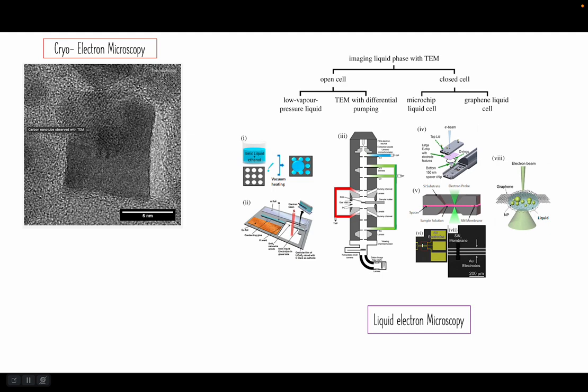Liquid electron microscopy is an approach to image and examine liquid or liquid-containing samples. It has occupied an important place in molecular research. Various cells and cellular structures can now be examined through thick liquid arrangement.